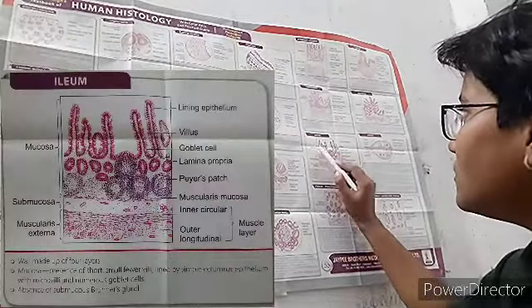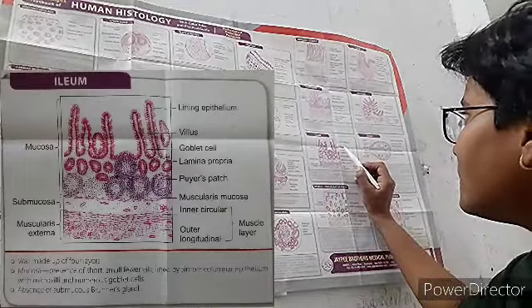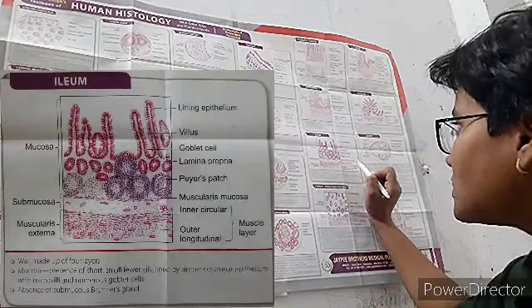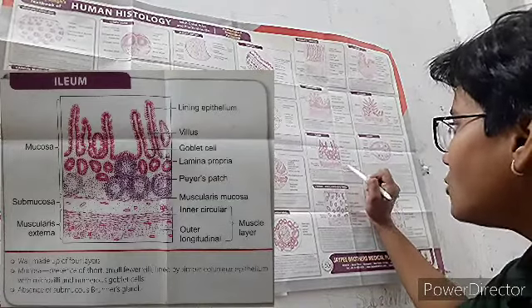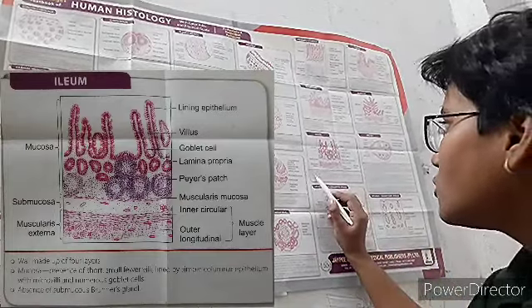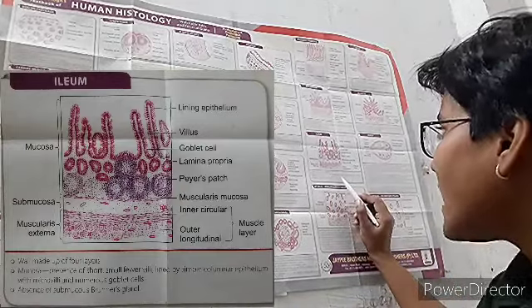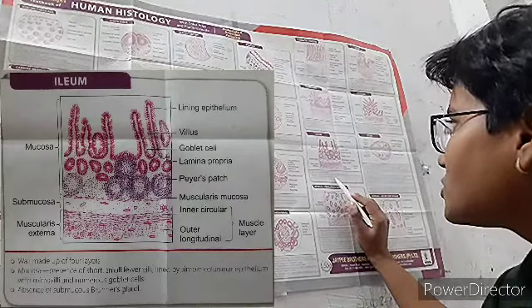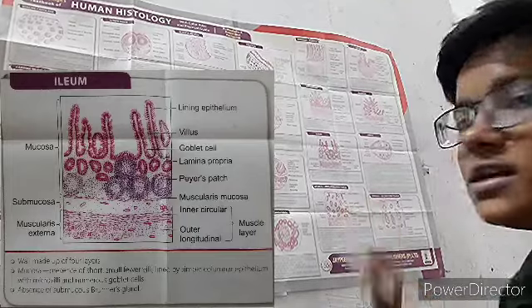Now the ileum. Visible structures include mucosa, submucosa, muscularis externa, villus, lining epithelium, goblet cells, lamina propria, Peyer's patches, muscularis mucosae, and inner circular and outer longitudinal muscle layers. The wall is made up of four layers. The mucosa has short, small, fewer villi lined by simple columnar epithelium with microvilli and numerous goblet cells. Brunner's glands are absent in the ileum.